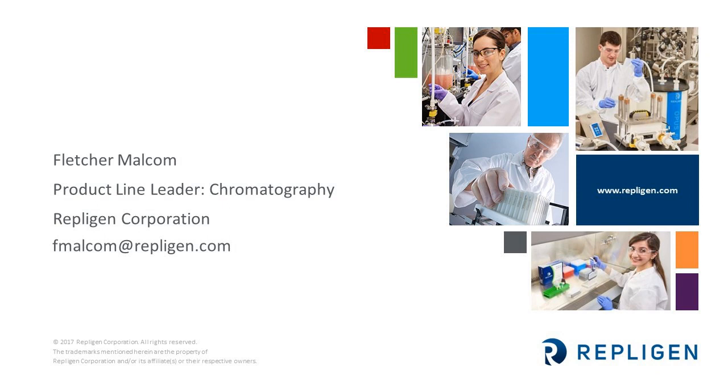How or is it possible for pre-packed columns to be integrated into continuous chromatography system? Yeah, that's a really interesting question. So today the solutions are, of course, you have a standalone continuous processing system and then pre-packed columns. I haven't seen any sort of fully integrated system, but I'm sure there's probably some things out in development that I'm not aware of. But today it is very much two different devices, the system and the column.